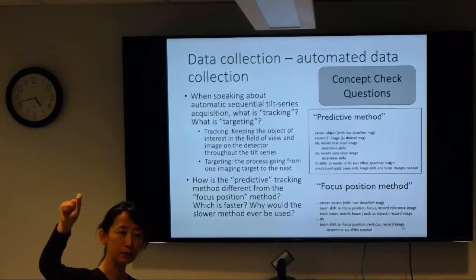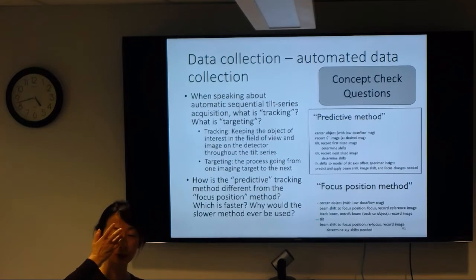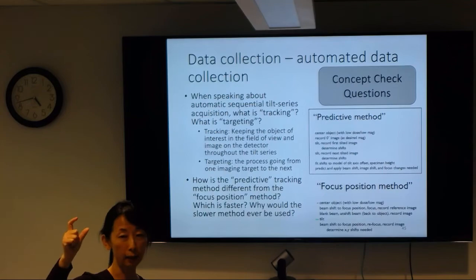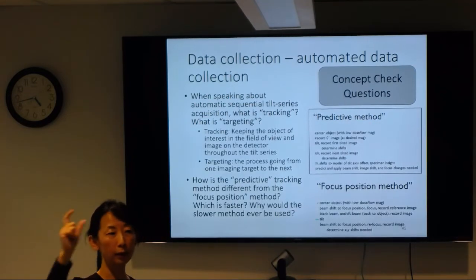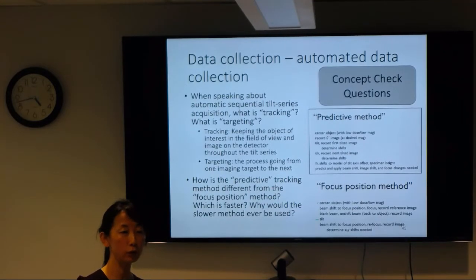Because the line from tracking to your imaging area is parallel to the tilting axis, the translation on your imaging area and on your tracking area should be the same. So when the tracking area, after tilting, moves left, your imaging area should also move left, exactly the same amplitude, right? The same number.